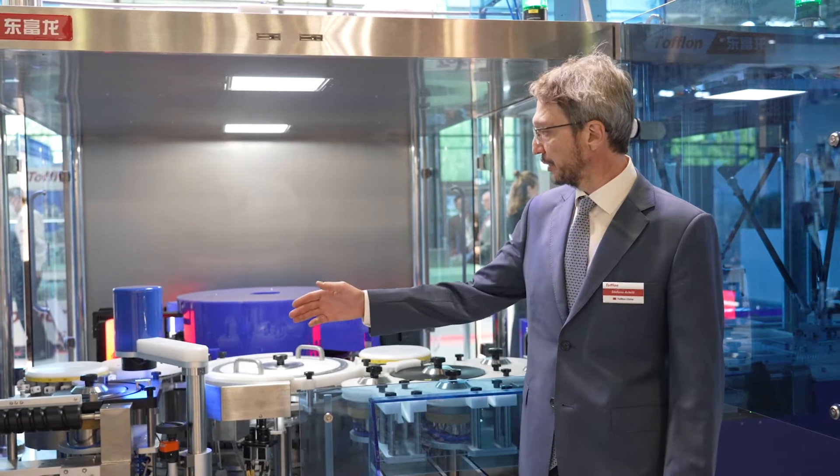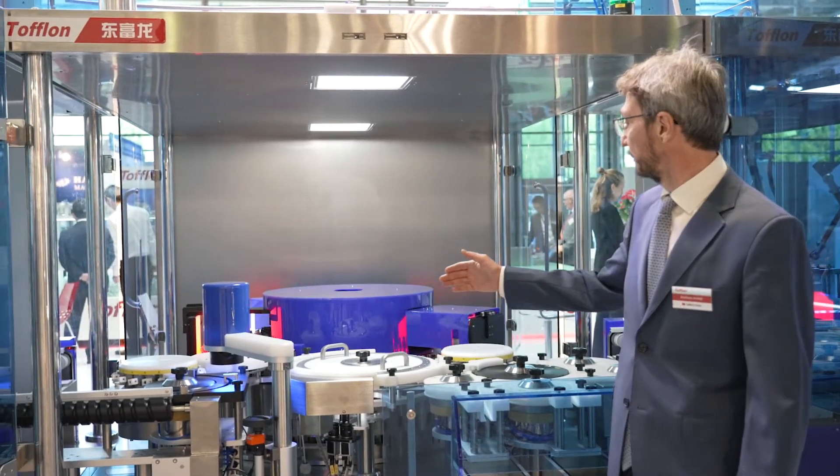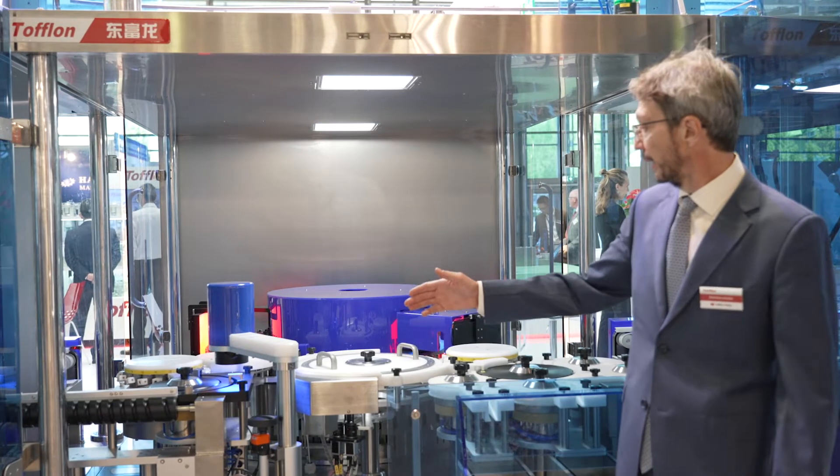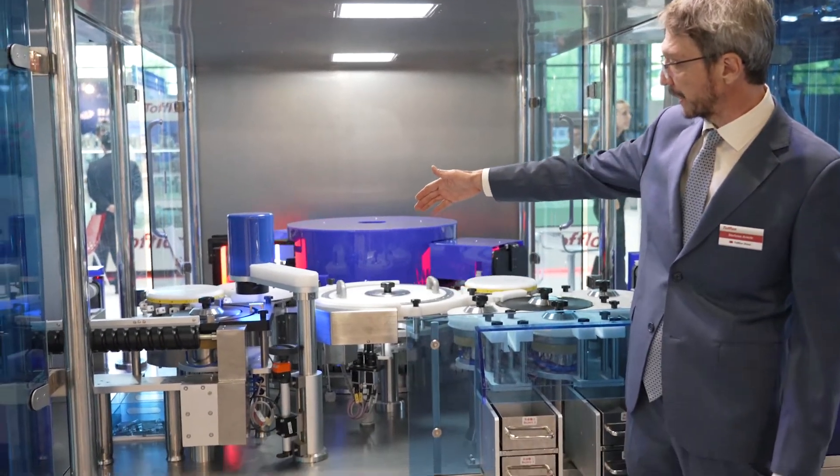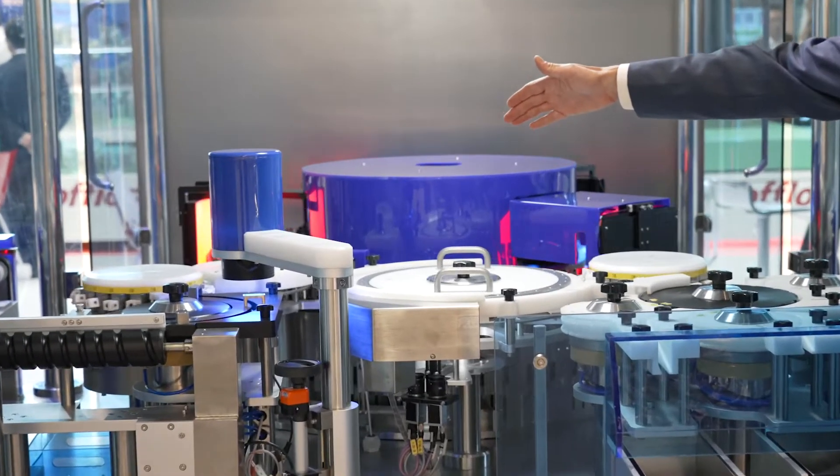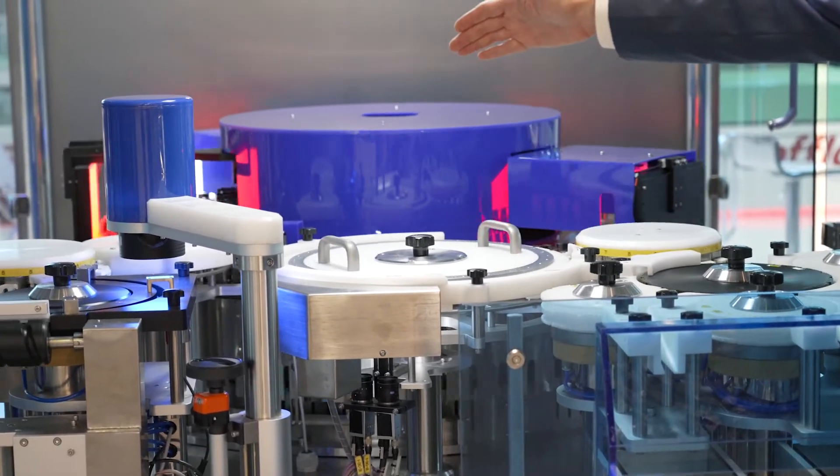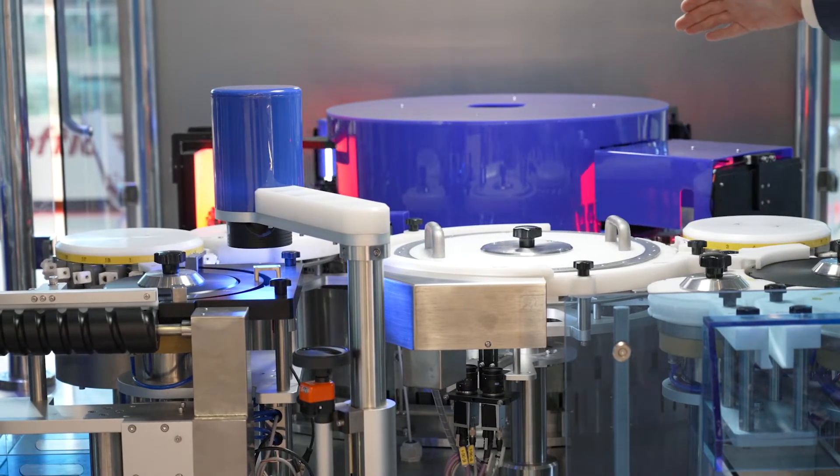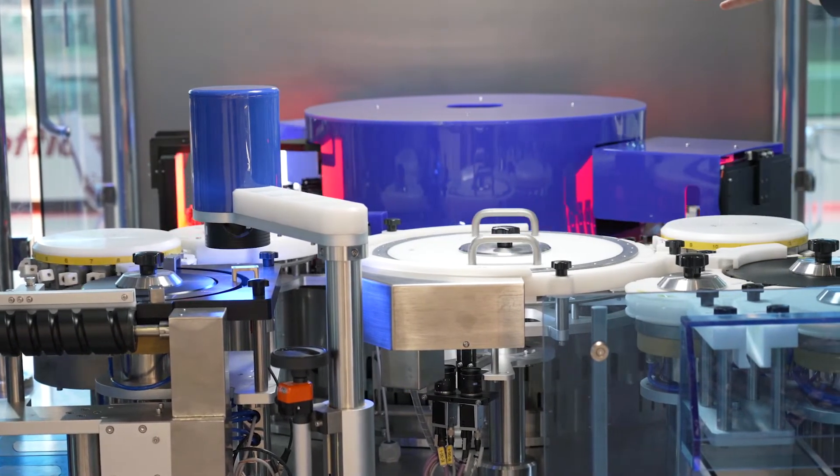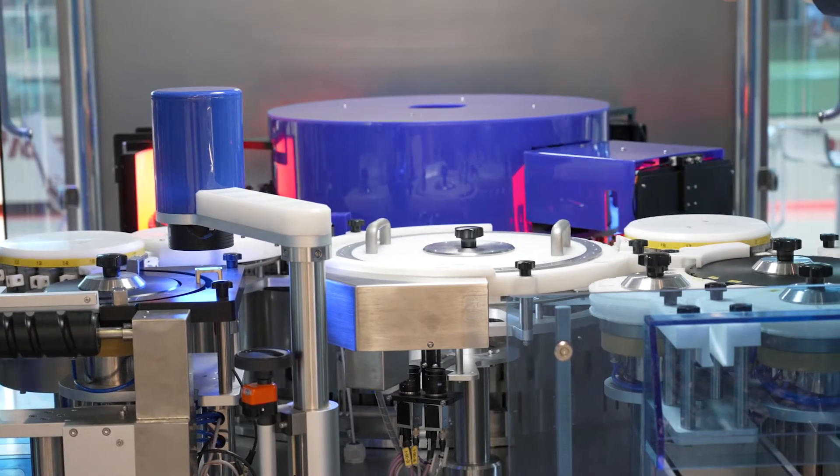Now I will show you the inspection area, the most important part of the machine. After infeed, the syringes are checked for the flange to reject the broken syringes. Then they are turned upside down and then they enter the inspection machine. In the inspection machine, in this case, we have four stations.